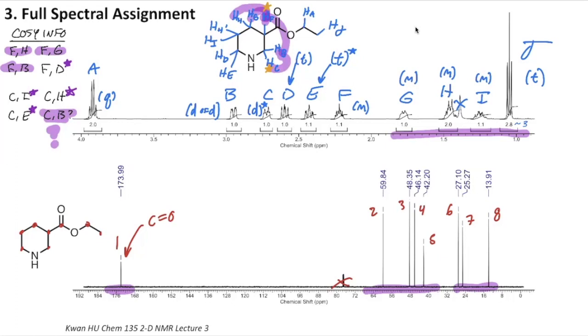We are going to have to figure out a way to put that somewhere else that makes a little bit more sense. So I'm going to erase these purple highlights here and put a big red highlight around proton C, to show that we need to move that somewhere else. We want to move it to a place where we would be in close proximity to I, H, and E. So if we look at where those are, here's I, here's H, here's another H, and here's E. It seems like we actually want to be kind of on the other half of the molecule over here and not over there. So maybe we could switch with D. That's the only one that's kind of not circled over here. So that seems like a good spot to me.